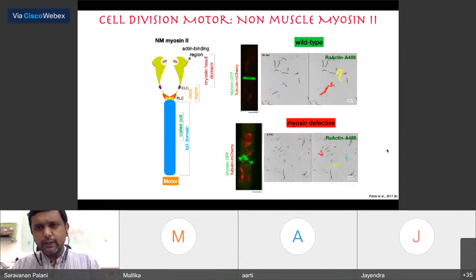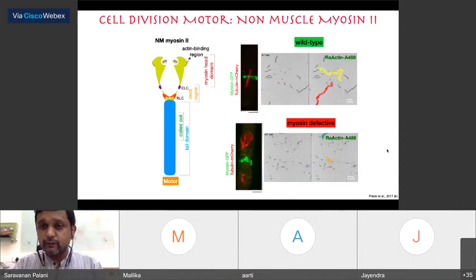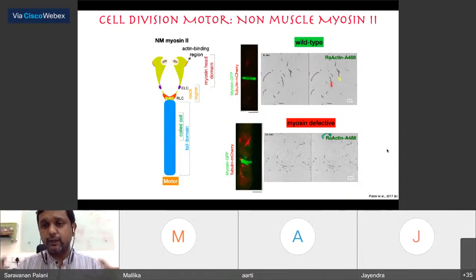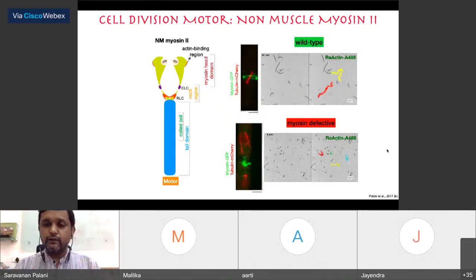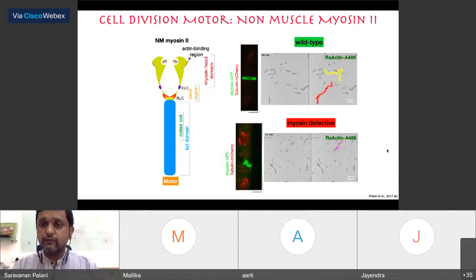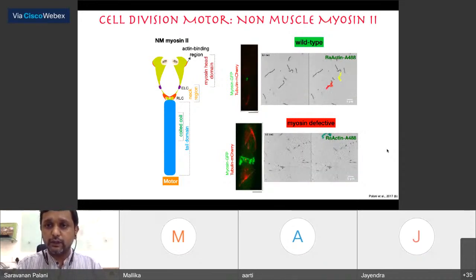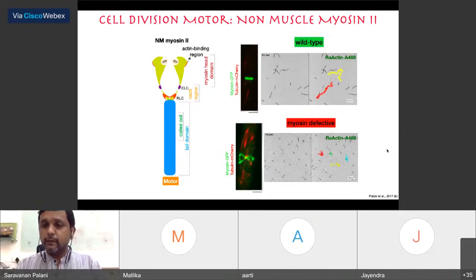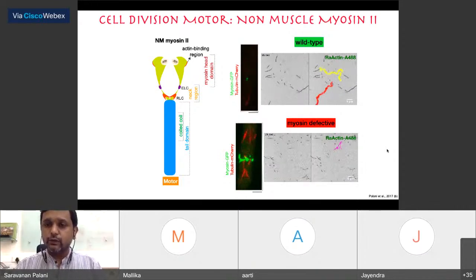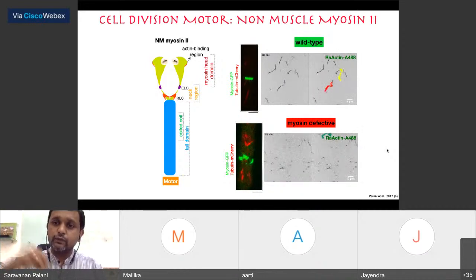One of the experiments we did was to purify the endogenous myosin along with the light chains, because myosin has a heavy chain that works with 2 light chains, the regulatory as well as the essential light chain. We purified this myosin from fission yeast as the original host source, tethered it on a polylysine or nitrocellulose coated surface, and then put the actin into the solution.